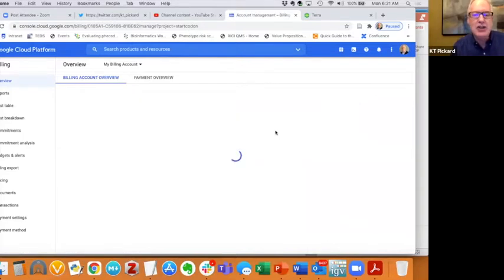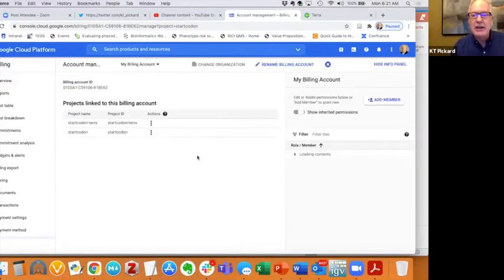I'm clicking on the manage link, and this is showing I need to add Terra into the billing information. And this is what I've done here, it's Terra-billing at terra.bio. It gets changed to Terra-billing at firecloud.org.